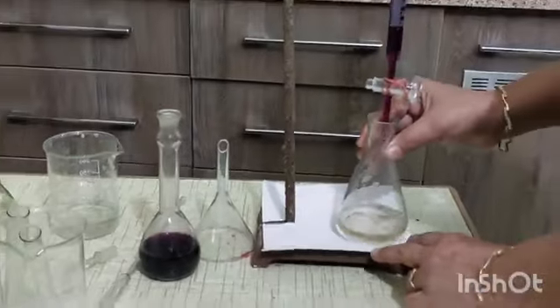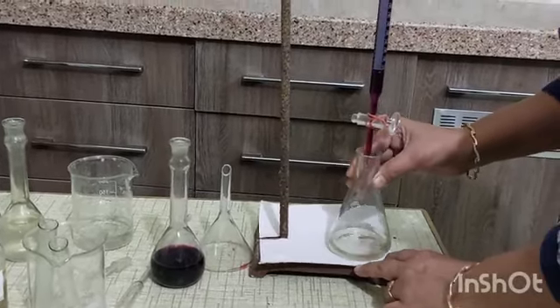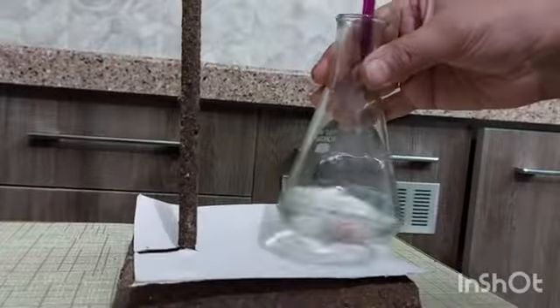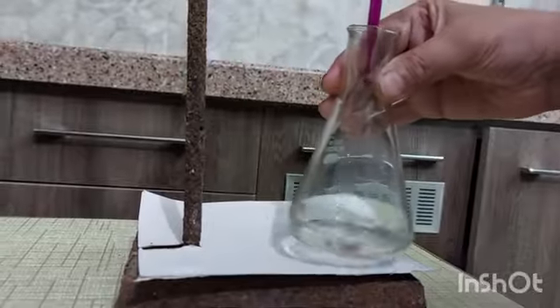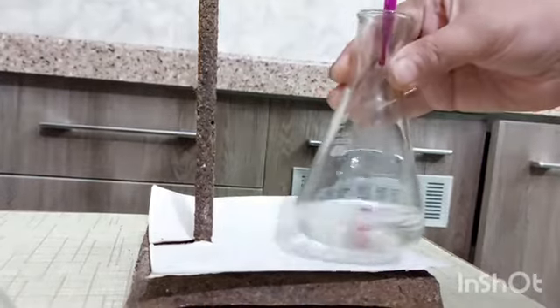KMnO4 is a self-indicator. When the transparent color changes into light pink color, that will be the end point of this titration.